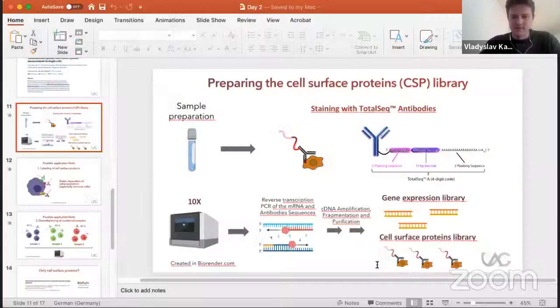So basically today we are analyzing the other side of single cell. We will dive into immunology, and we will have to deal with some immunological cells. And we will not only analyze the RNA signal itself today, but we will also analyze the protein signal of these cells. So to remind you a little bit what we are talking about today, I would like to share the screen with the presentation from day 2.